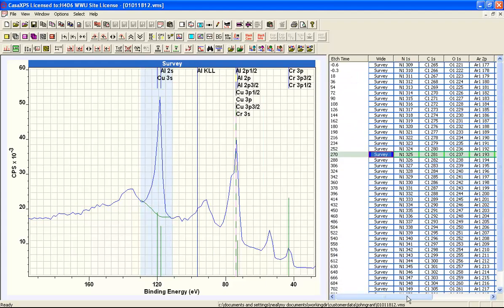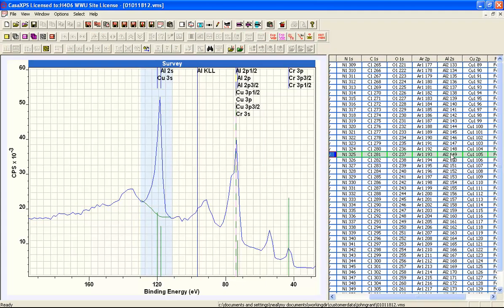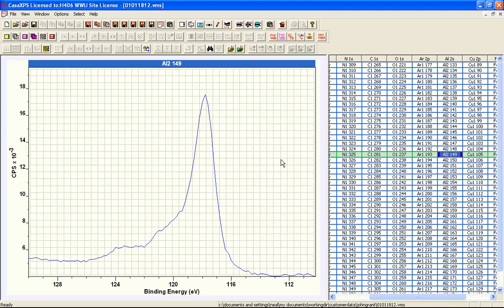Looking at other data collected at this level in the depth profile, we have a spectrum containing peaks identifiable as copper, aluminium oxide, and metallic aluminium. If we have a peak model for this spectrum, we can proportion the intensity seen here with respect to the peak model. With relative sensitivity factors for each component peak, we can work out an effective relative sensitivity factor for use in the survey spectrum quantification.